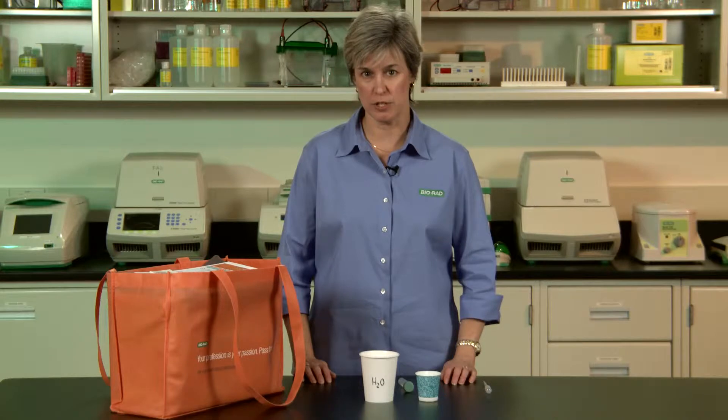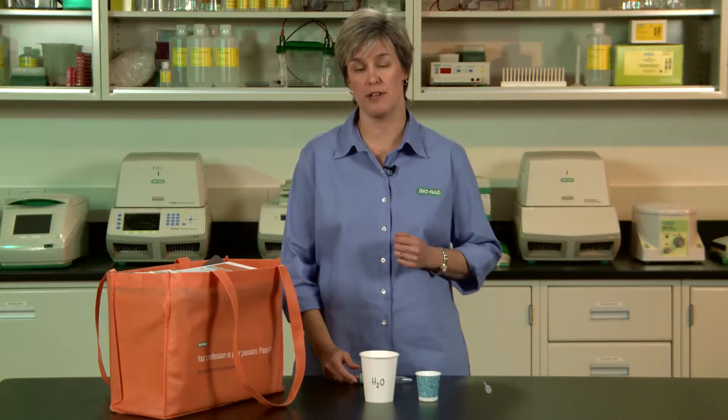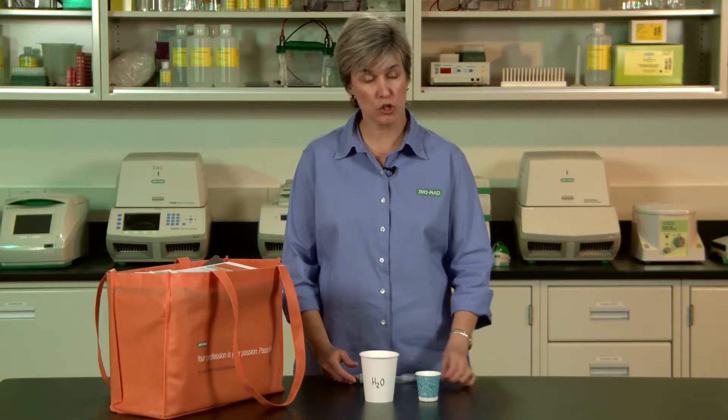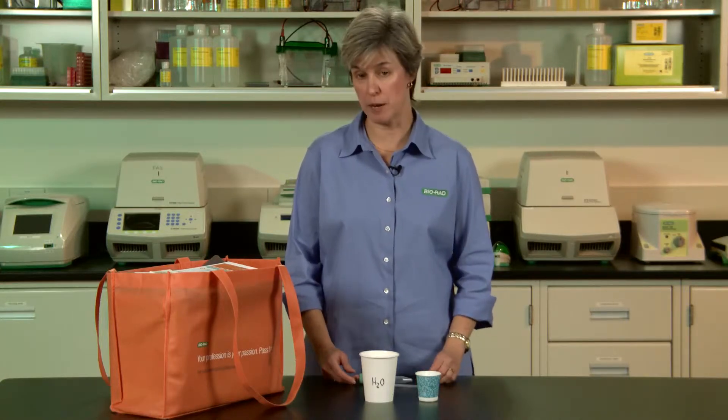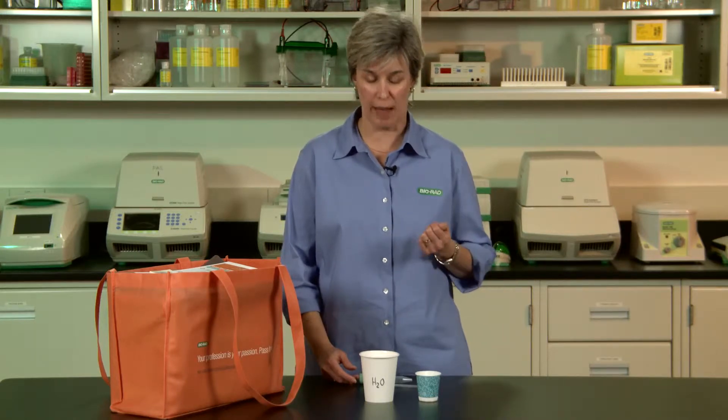We've provided a few tips to make sure you have a really successful day with students. We've run this lab many times with students and teachers, and we've got a few special tricks for you. One of the things you really want to make sure you've done is to talk to the teacher before the day of your event. You need to find out how much time you will have and what grade level the students are at. Have they ever used a transfer pipette before? If the teacher can do that ahead of time, great — but if not, we'll show you one way you can incorporate practice with water and also prepare for the lab.